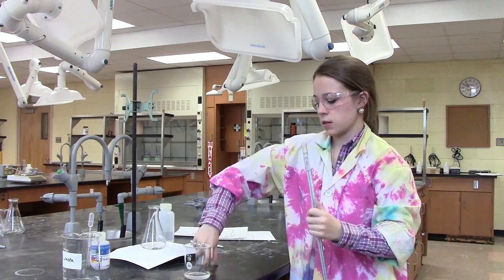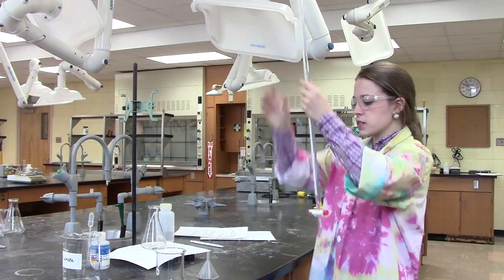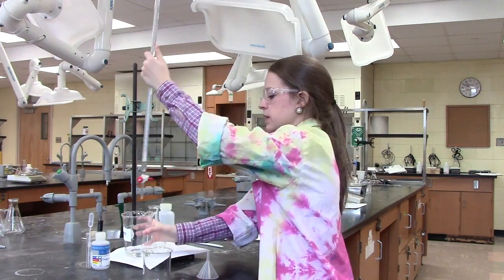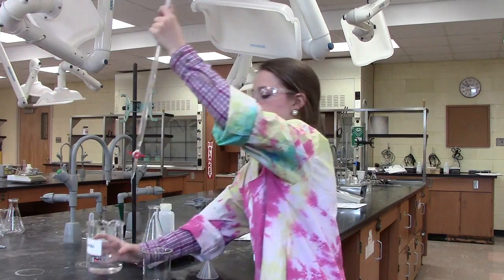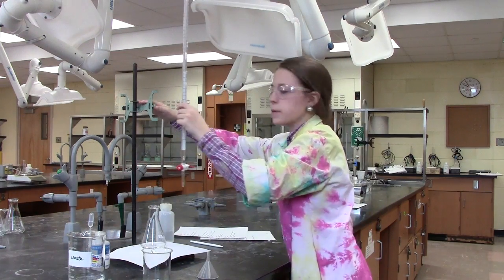Now that our burette is both cleaned and rinsed, we're ready to pour in the solution that we're going to be measuring. Again, we can do this by using the funnel. Once we've poured our solution, we need to fill the tip. This can be done by briefly opening the stopper and then shutting it once more. It's very important that this is done before the initial reading is taken, otherwise your measurements can be affected.